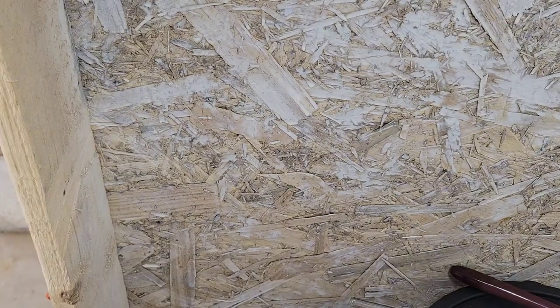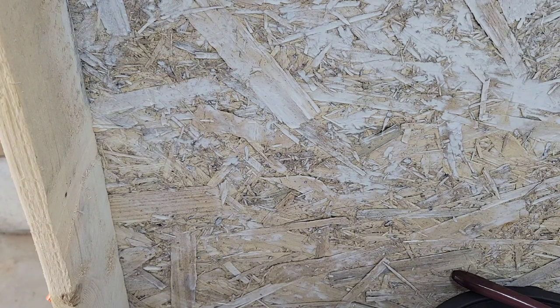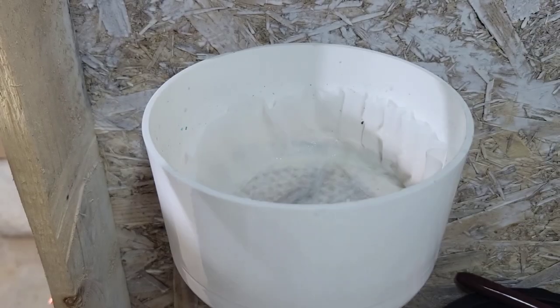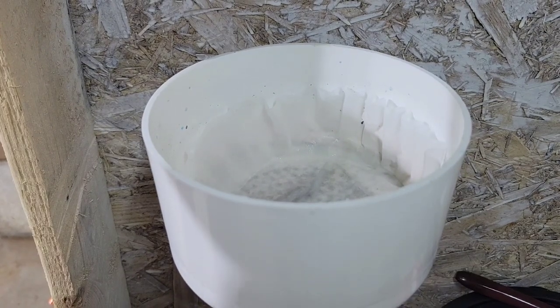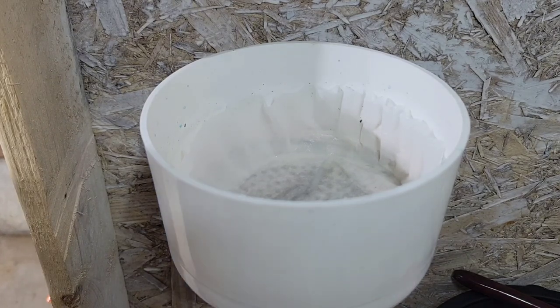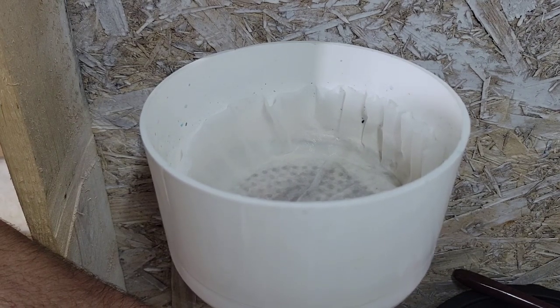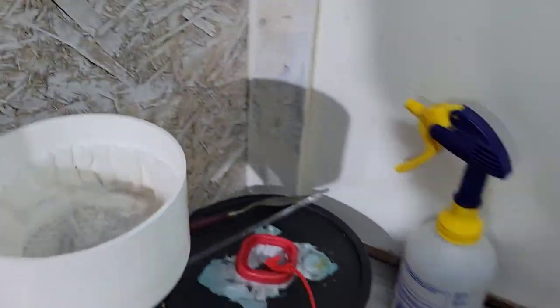This out so I can drain our copper nitrate solution. I'm just gonna go ahead and put that in my waste bucket. Put the hose on for a vacuum. And I'm gonna have to move you guys.